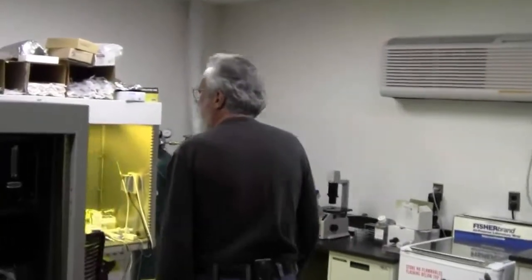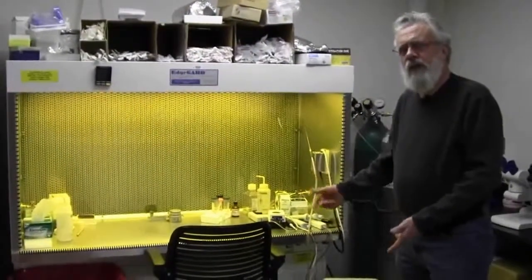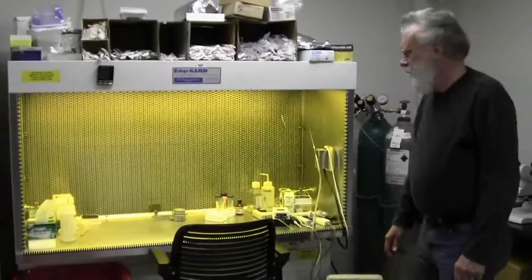So here we are in the microbeam laboratory. There are two sections of the laboratory. First, I'll show you this. This is the equipment that the biologists use in preparing the cells.